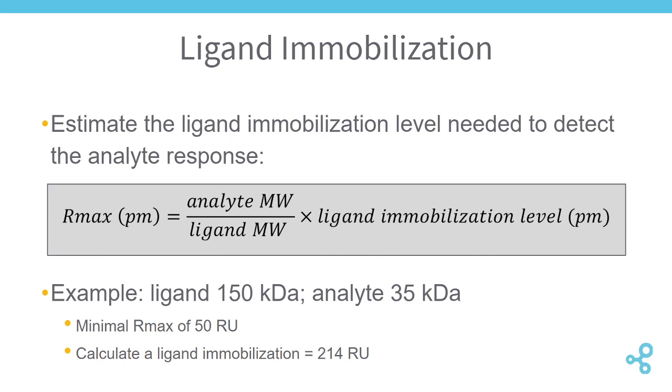Because if you have not done an experiment yet, or you've done a few, we do recommend that you have our sensor chip tech guide with you to go through what the full ligand immobilization procedure would look like. And then you can start playing around with what kinds of numbers you would like to see when you run this experiment.